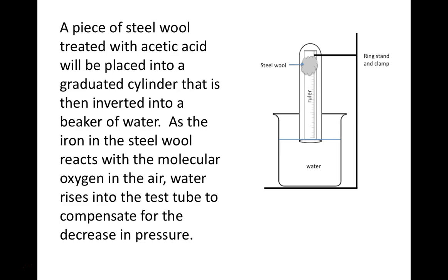We can measure that change in the water from the start of the experiment, and how that water gets sucked up into the inverted tube. We'll know that volume change, and since the volume change of the water can be associated with the oxygen, we can calculate how many moles of oxygen are being consumed over time.